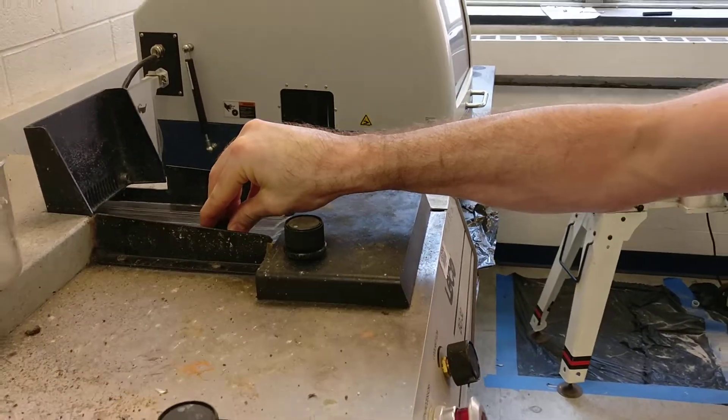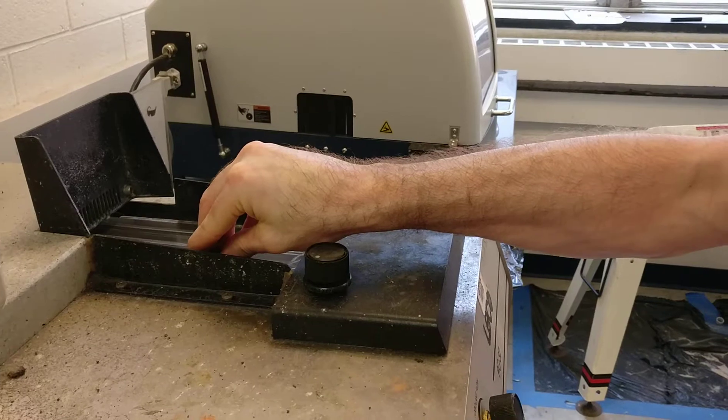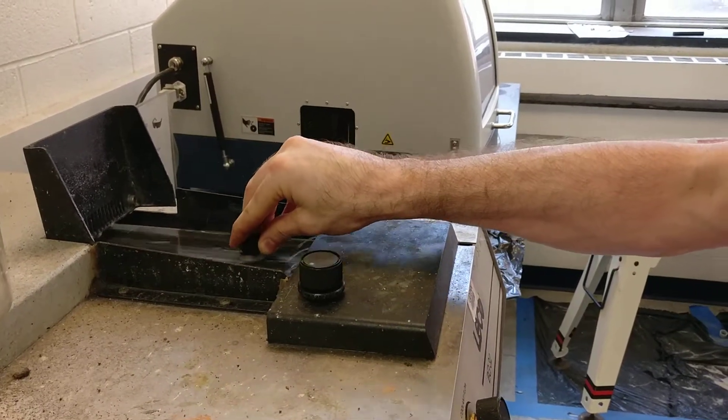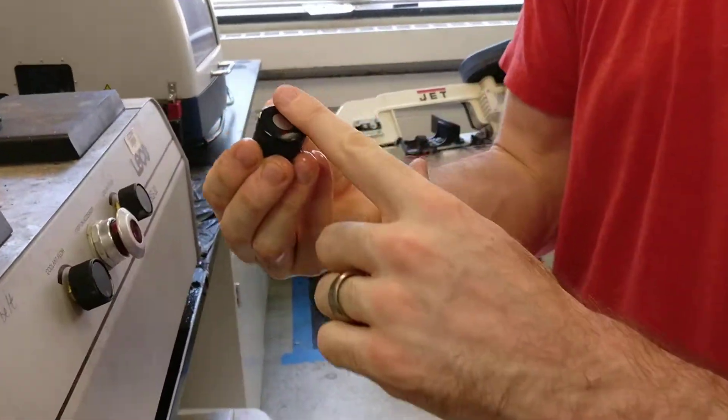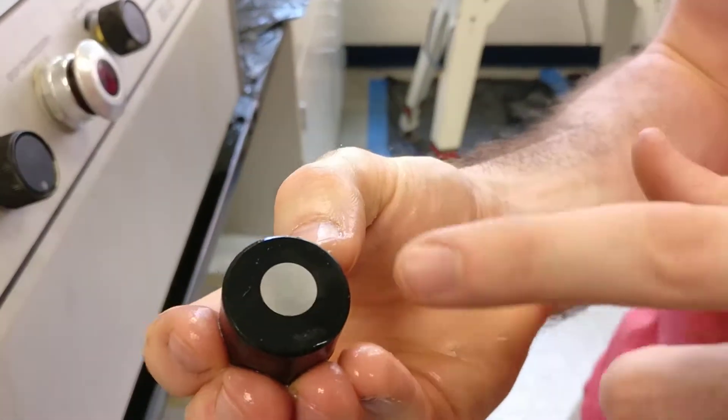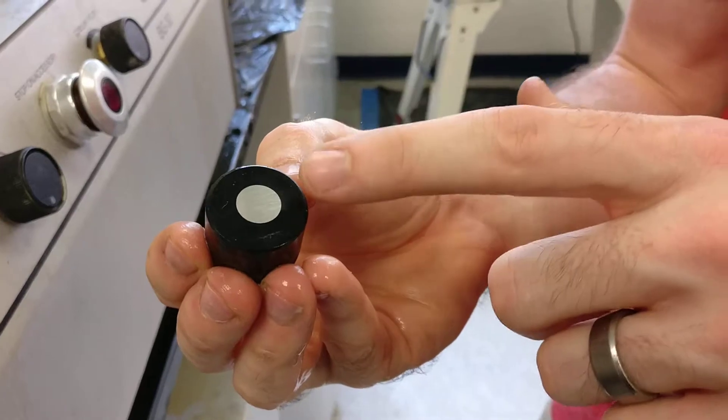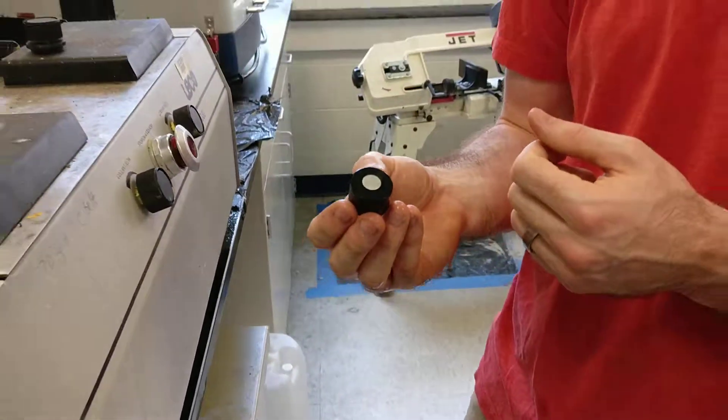You want to feel the friction of the belt. We want to make sure that you don't see scratches from the previous direction on your sample. And now we're ready to go to the smaller wheels.